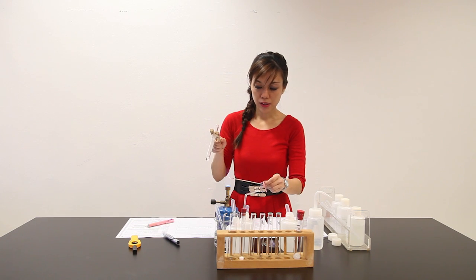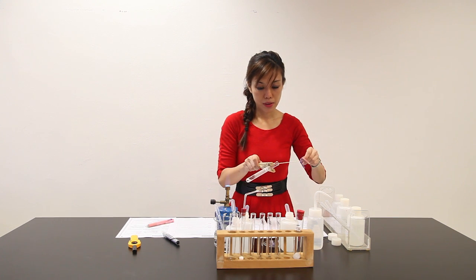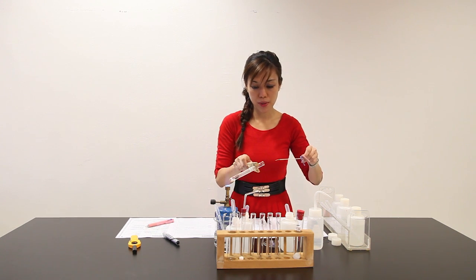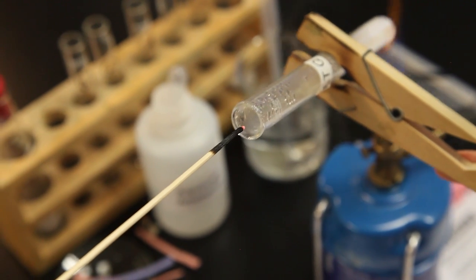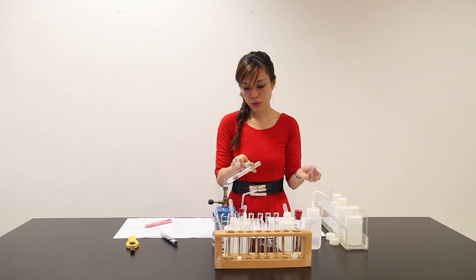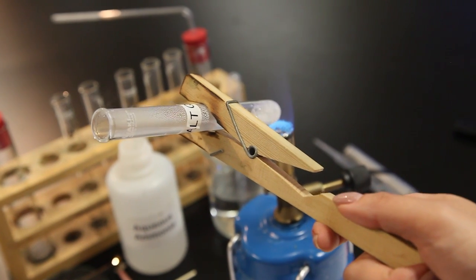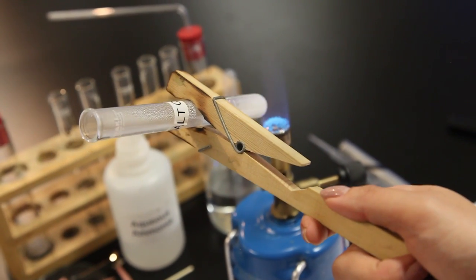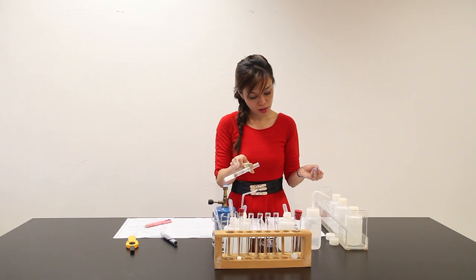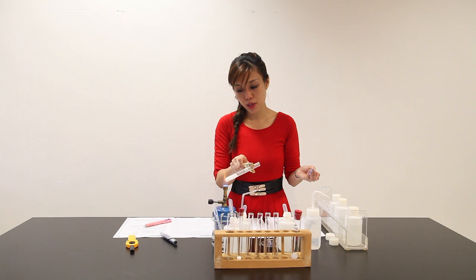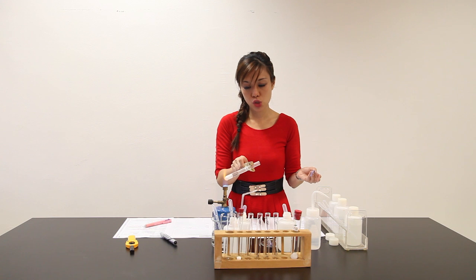Let me test. As the gas evolved, we light the glowing splint. Gas evolved has no reaction with the glowing splint. As I'm further heating, you notice that it turns from the clear solution and becomes a whitish powder liquid. I have to heat for another minute or so. Whenever the question says to heat for another minute or so, we have to heat it very strongly.